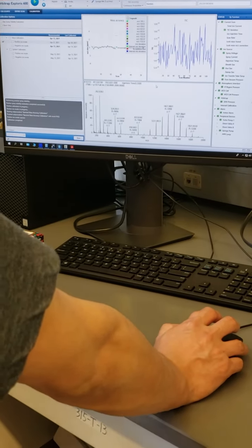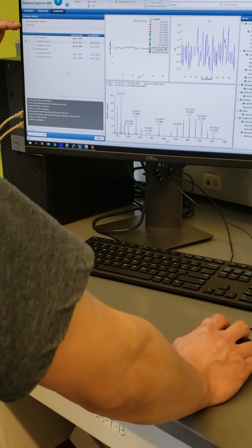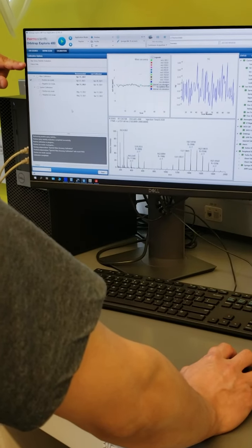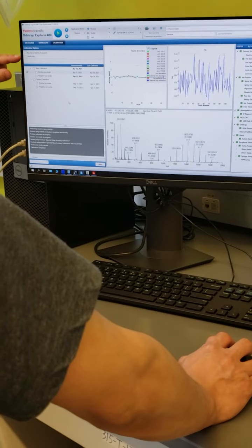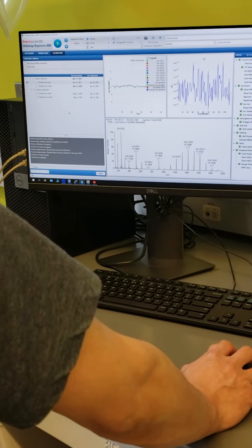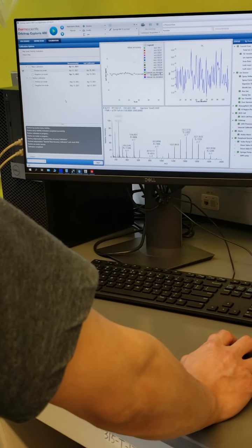The difference between check and calibrate: if you do check only, it's only going to see if it meets the criteria, and then it's going to stop. If it tells you it failed, it's not going to calibrate it. It's just going to tell you you failed your calibration. Then you would have to go and calibrate it.